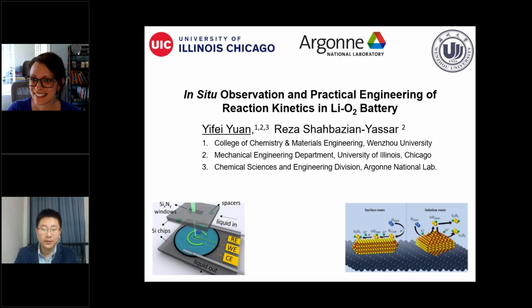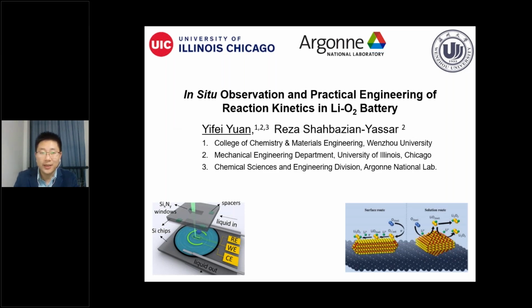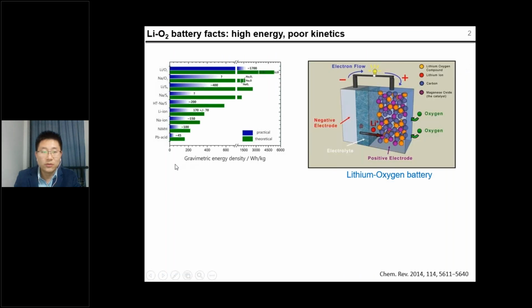Okay. Thank you, Jennifer, for the introduction, and thanks to Protochips for organizing this webinar, so that I have the chance to introduce to everybody the work that Professor Reza Yassar and I did back at the University of Illinois Chicago. We did a lot of in situ TEM microscopy on battery materials, and specifically this one using in situ liquid electrochemical TEM to observe lithium-oxygen battery reaction kinetics. Let's move to the next page.